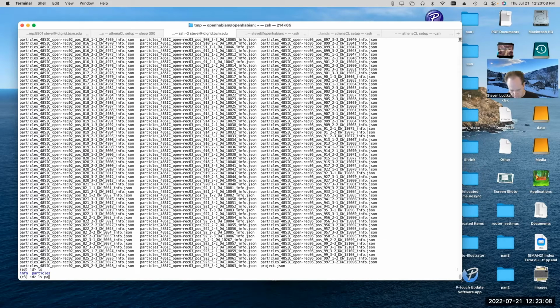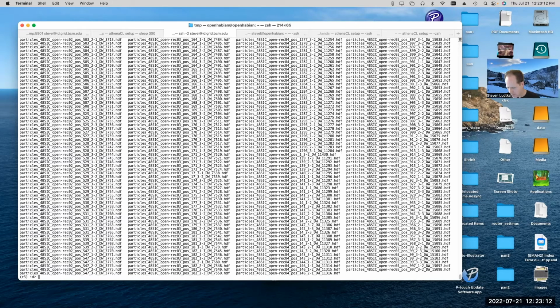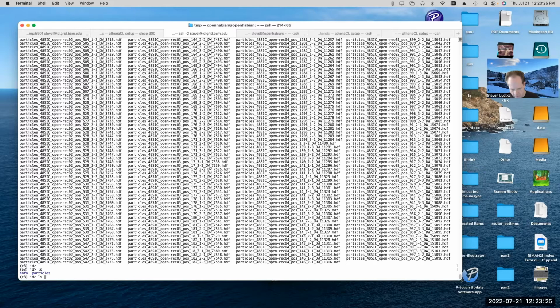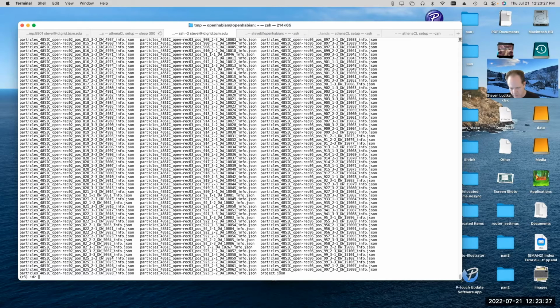The particles folder will have basically exactly what was in the other particles folder we looked at a minute ago, except instead of being MRCS files, they're HDF files. HDF is the native file format that EMAN2 uses. And the info folder will contain all of the metadata on a per micrograph basis.